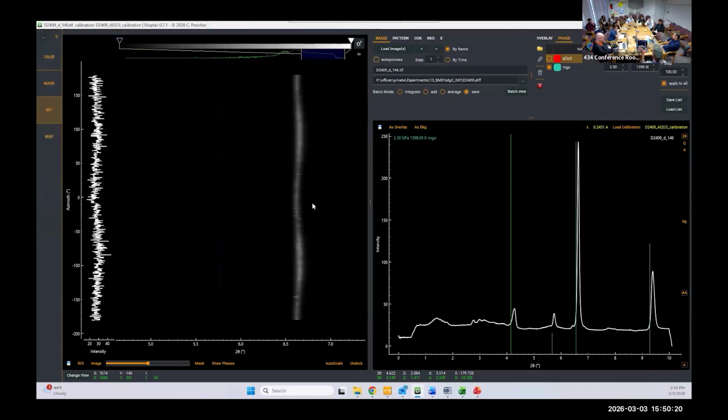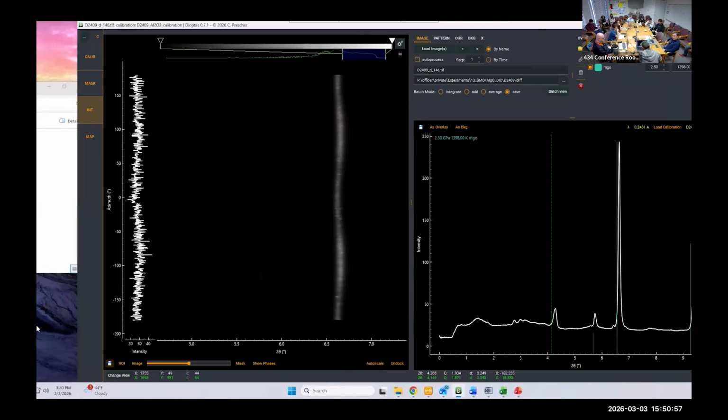Yeah. So there is a way, if you have 25 patterns, it's annoying, but it'll take you 5 minutes. If you have like 1,500 patterns, you really wouldn't want to do this. And I know a way that you can batch process them, but that is also a really annoying program. I will say though, the guy who wrote this program used to work here and he's always upgrading it. So I suspect in not too long, there'll be a batch process to it. But at the moment, there's not. So I'm just going to do a few for now.